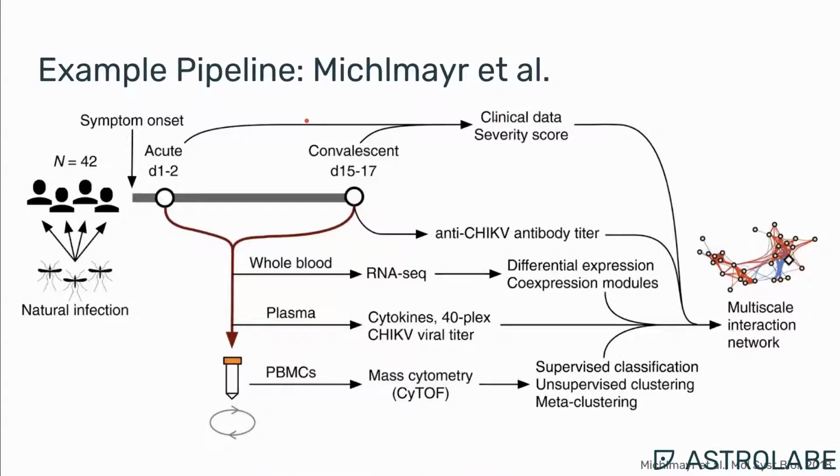So I'm going to discuss an example pipeline that came from a paper that was published a few years ago.